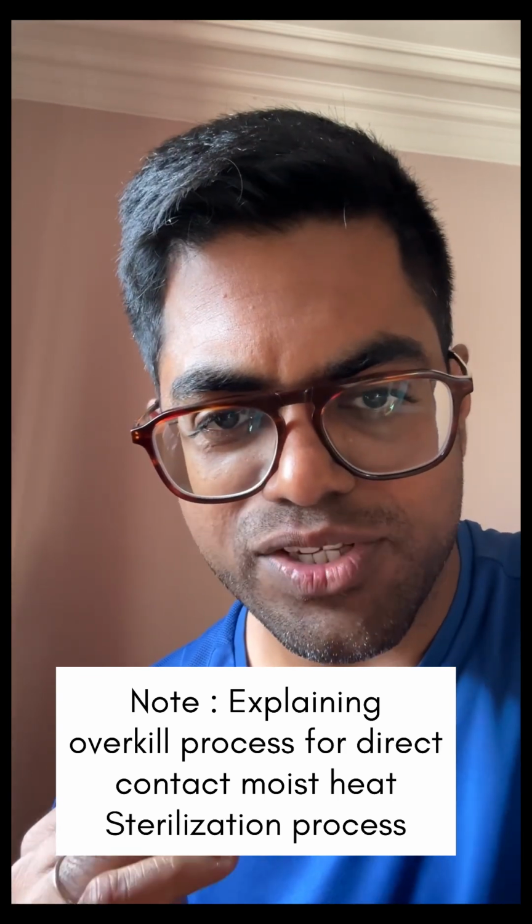And as per PDA Tier 1, a D value of 1 will be the worst case D value ever, which is not really a naturally occurring bioburden or resistant spore available in your facility. So 1 is considered a highly resistant spore.